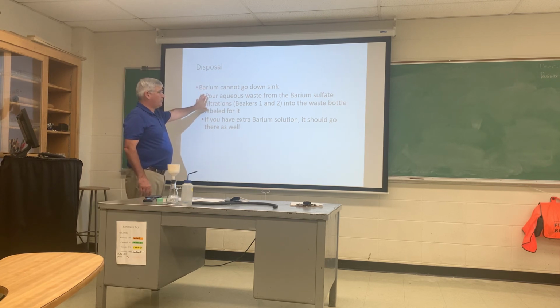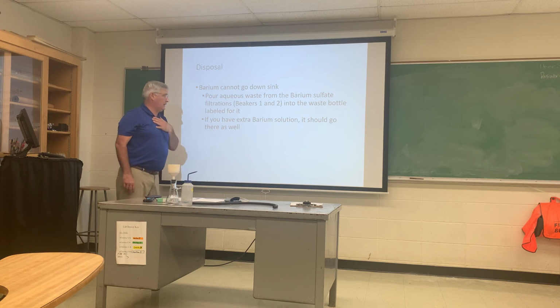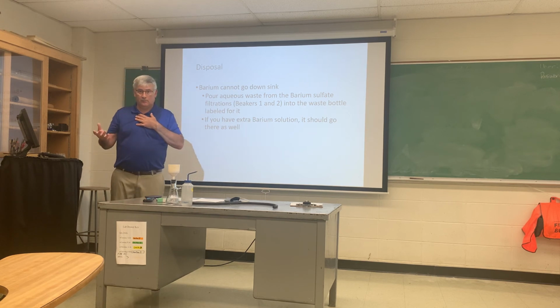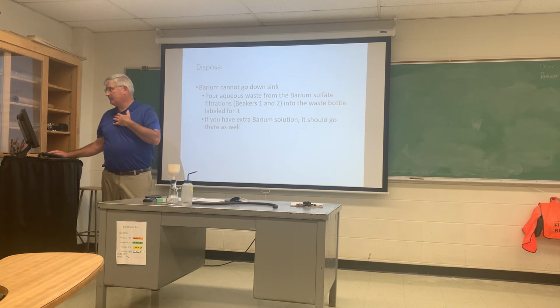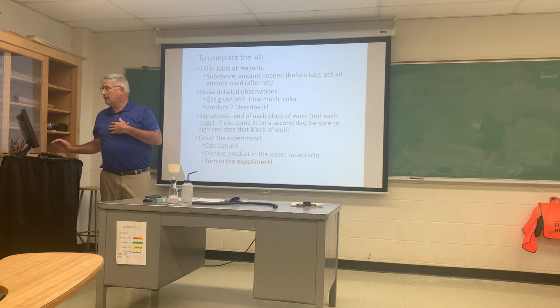And so that aqueous waste from the barium reactions, beakers 1 and 2, has to go in the container that we have in the hood in the back, and it will be appropriately labeled. If you are unsure, please ask me, and I will help you find where that goes. All right, the other solution can be disposed of in the drain.